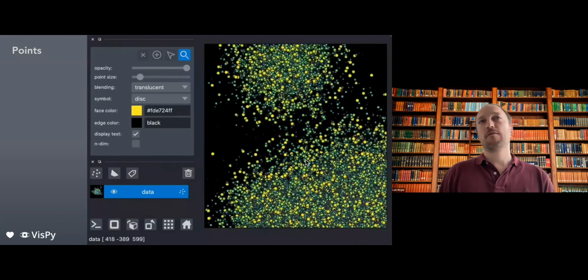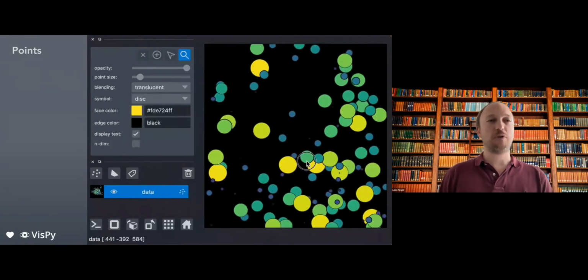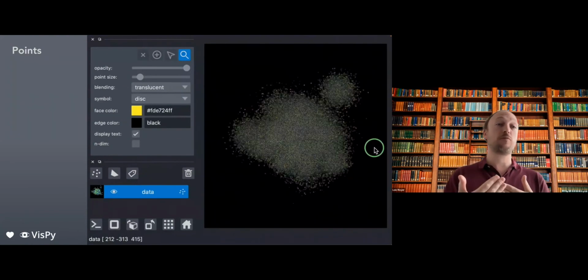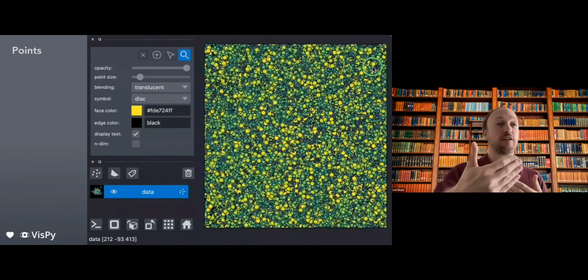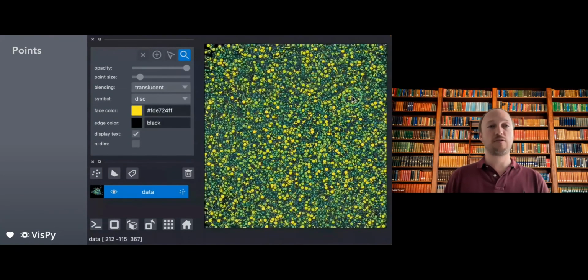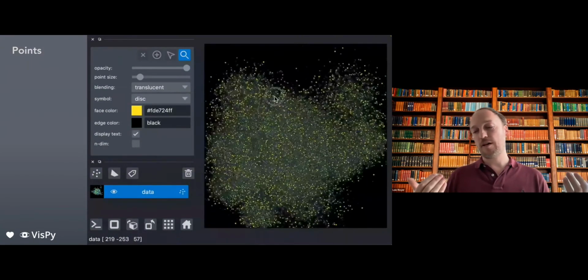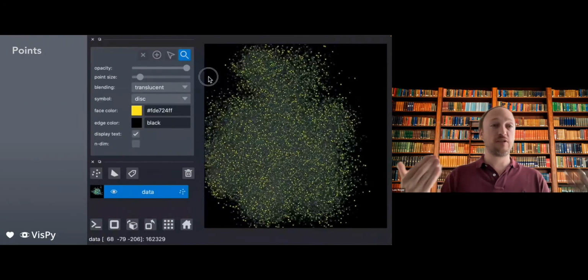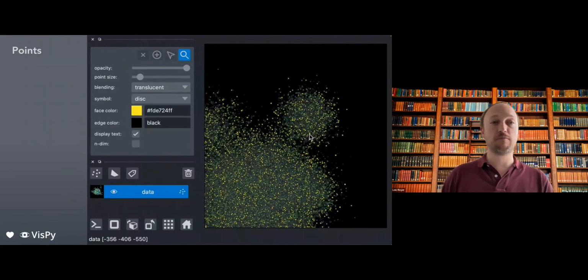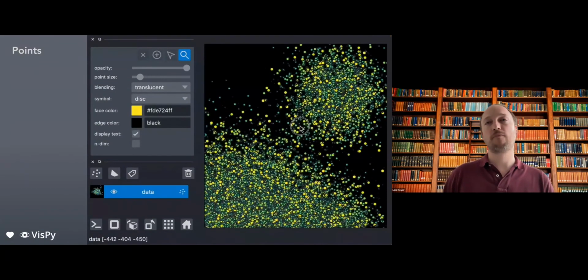There are so many possible applications of this, especially when you can overlay that on top of images, but possibly on top of other kinds of layers. You can see that there are all sorts of possible interactions and visualization opportunities when you combine these layers together, or you can use them individually. So anything is really possible here.